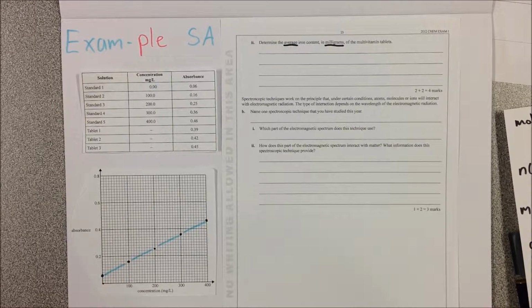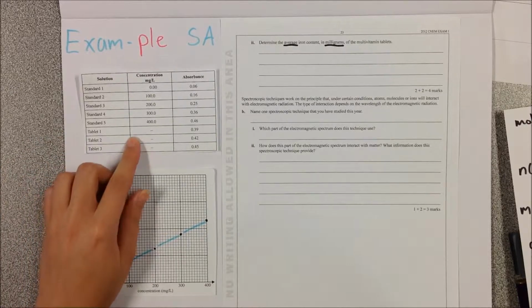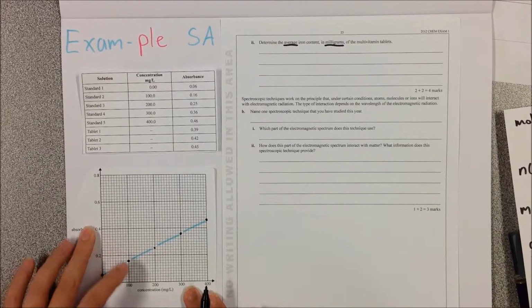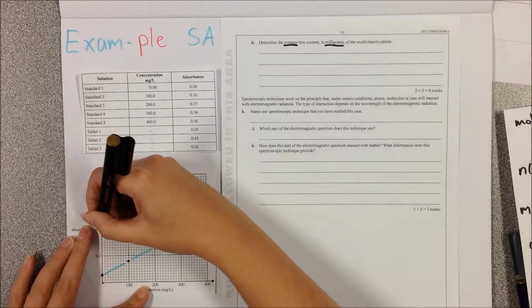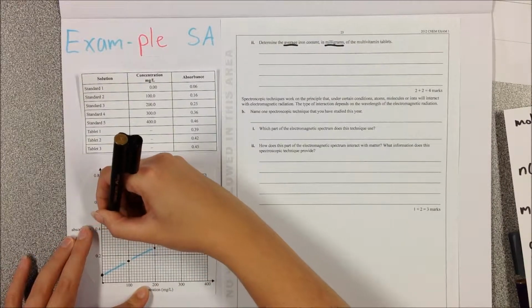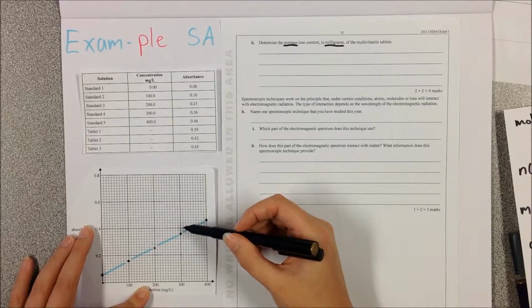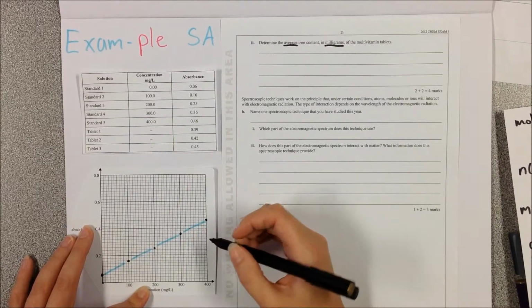The first thing we need to do is determine the concentrations of the tablet solutions. So it's as easy as going to your graph, looking at, so if we look at tablet 1, it had an absorbance of 0.39, going to 0.39, which would be in between those 2 there, and going across and seeing that that matches up with. Now we just repeat that for the other 2 tablets exactly the same way.